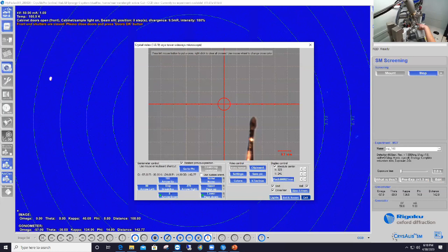So once the pin is in that orientation, it makes a straight angle with the crystal camera that is up here. So this is the red box here that is the crystal camera. So like I said, there is now a straight angle between the orientation of the pin shown by my left finger and the orientation of the camera shown by my right finger here.